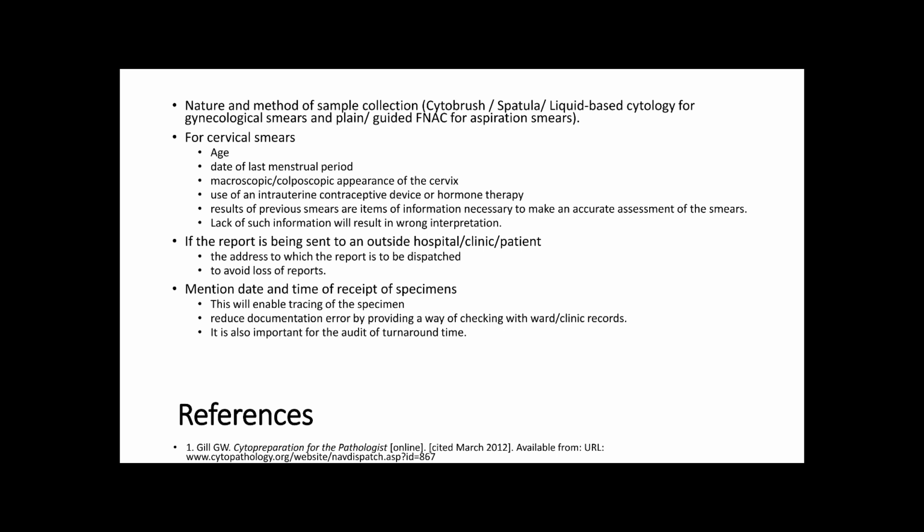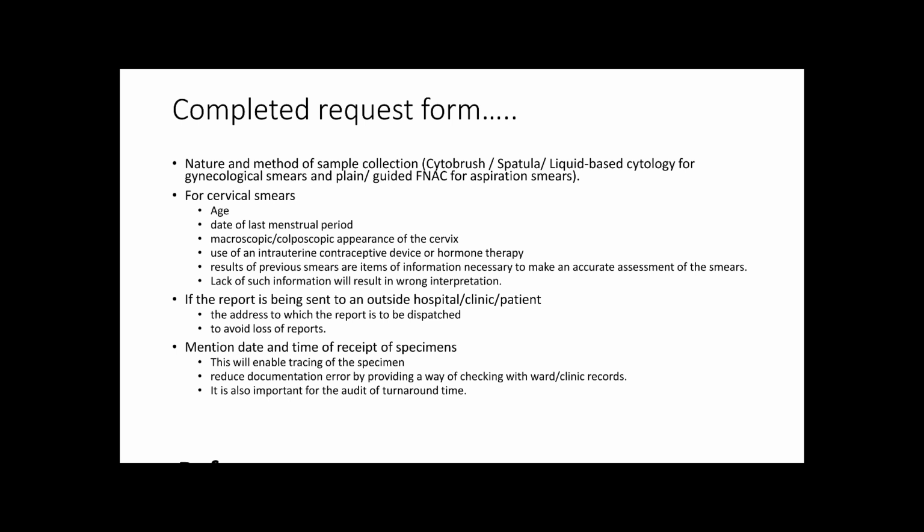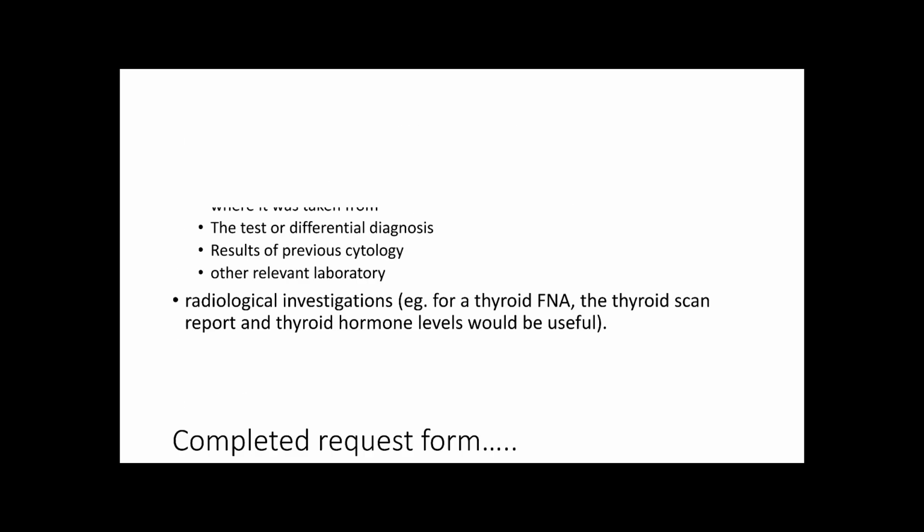And mention the date and the time of receipt of specimen on the request form as well as in the specimen reception record. This will enable tracking of the specimen and reduce the documentation error by providing a way of seeking or checking with wards or clinic records. It's also important for the audits of turnaround time, right?